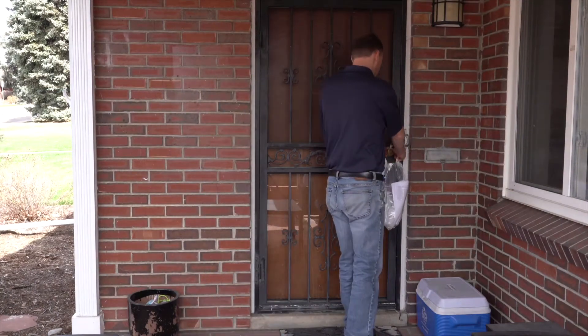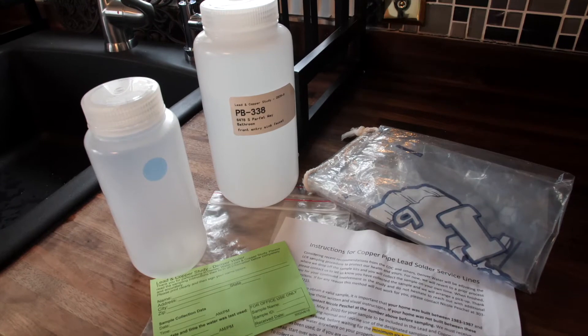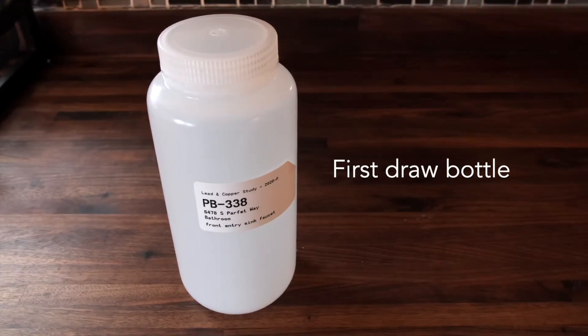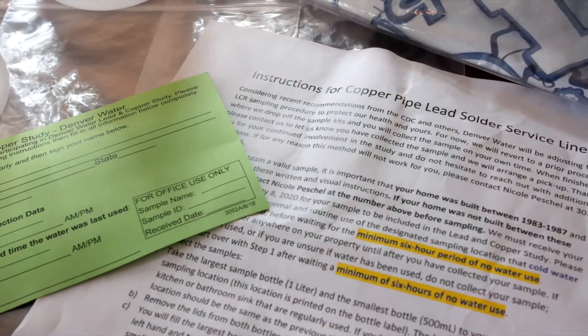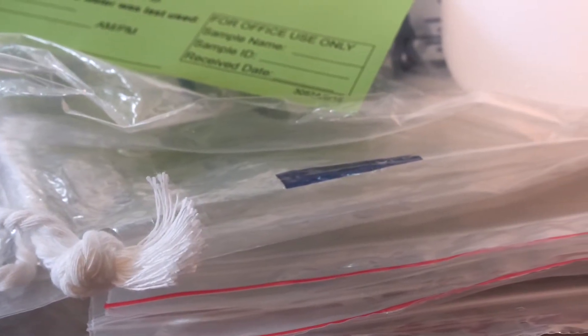Participants in the study will receive a sample kit that Denver Water will deliver to your door. Take out the items and check to make sure you have the following: a one liter bottle for the first draw sample — that's the one that has the labels on it — a smaller 500 milliliter bottle, a green card for sample information, paper instructions, two resealable bags, and a large plastic bag with a drawstring.